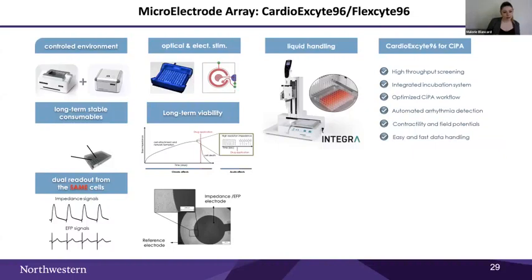To explain a bit, you have a controlled environment. The cells are at 37 degrees, you have the CO2 at 5%, and you also have humidity. So it's really like an incubator. You can leave your cells for like 48 hours if you want. There is absolutely no problem.